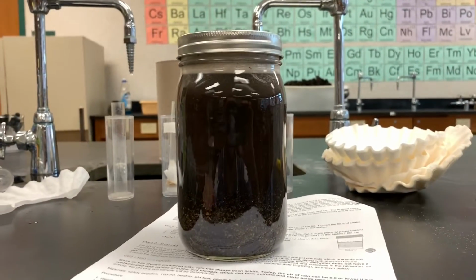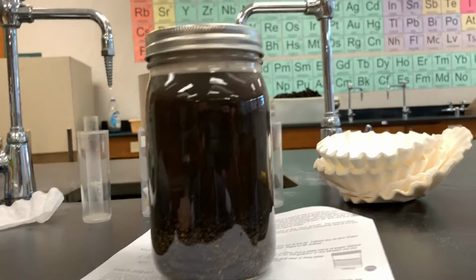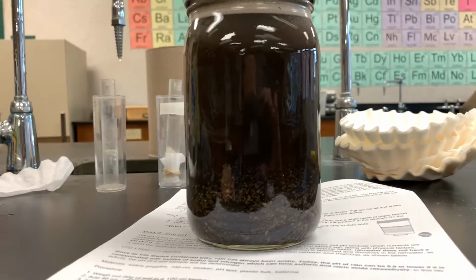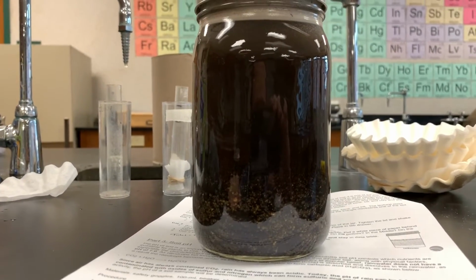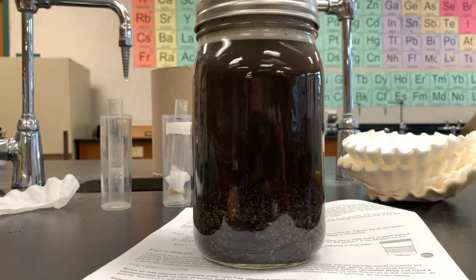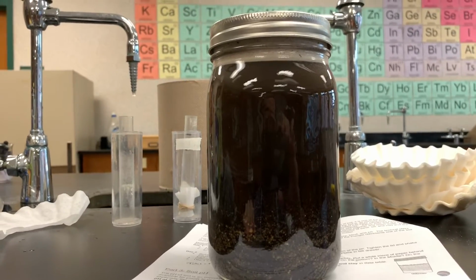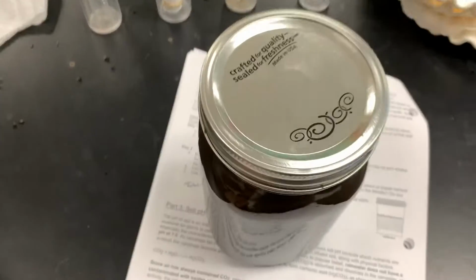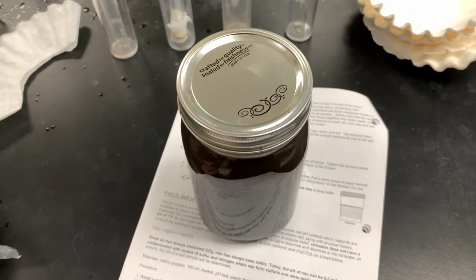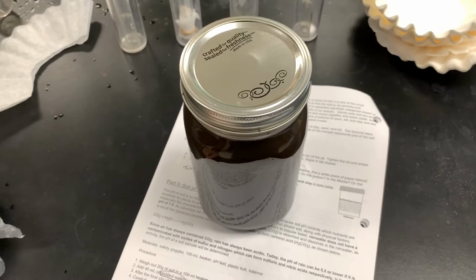And so once it's shaken up, you can already see some of the particles settling there, and that's it. We'll write our name on it, probably with a wet erase marker on the lid here, or initials or something like that, and let it sit. And we'll deal with the rest of it the next day. We'll look at the different layers and see what we got.